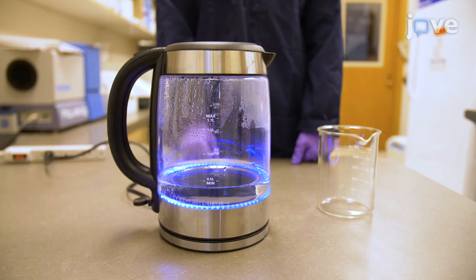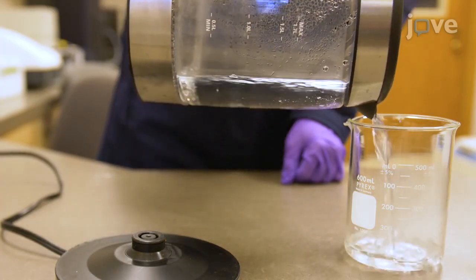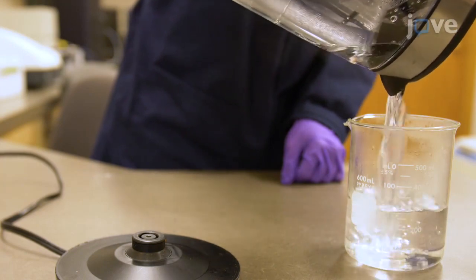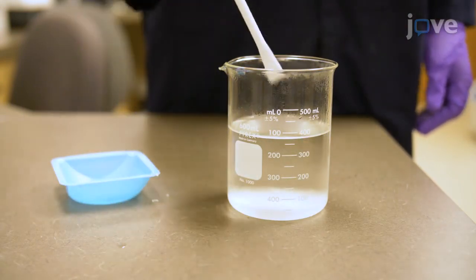Begin by boiling 350 milliliters of deionized water using a tea kettle, then transfer the hot water to a 500 milliliter beaker. Use heat protection gloves and make sure that the glassware can withstand the boiling water temperatures. Completely dissolve 42.5 grams of granulated sucrose into the hot water using a stir rod.